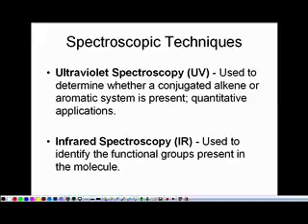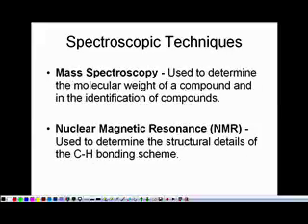And then there's mass spectrometry that is used to get the molecular weight of a molecule and also the identification of it. If you watch any forensic shows, whether they're made up, like all the CSIs, or Crossing Jordan, which isn't on anymore, or NCIS, or there's so many of them out there, the ones that aren't real versus the ones on Court TV that are real, you'll oftentimes hear about the GC mass spectrometer, which is the tool that everybody uses to solve everything besides DNA.